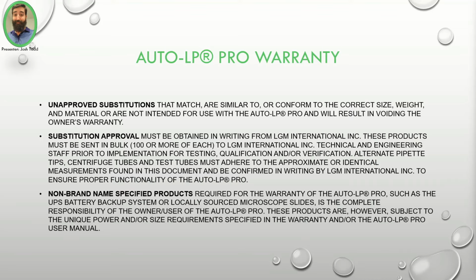Alternate pipette tips, centrifuge tubes, and test tubes must adhere to the approximate or identical measurements found in this document and must be confirmed in writing by LGM International to ensure proper functionality of the AutoLP Pro.